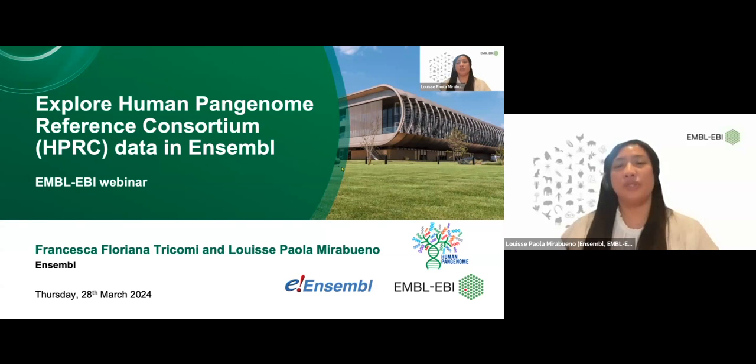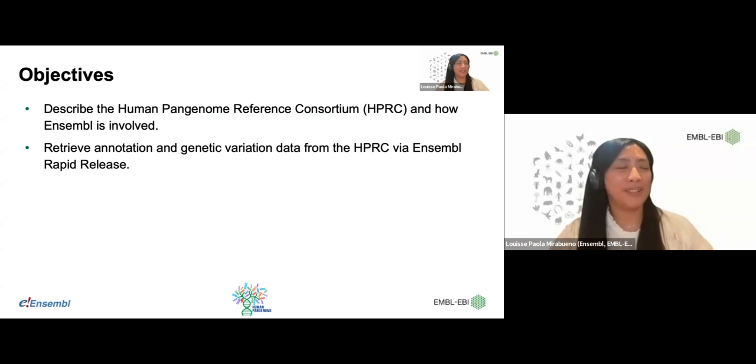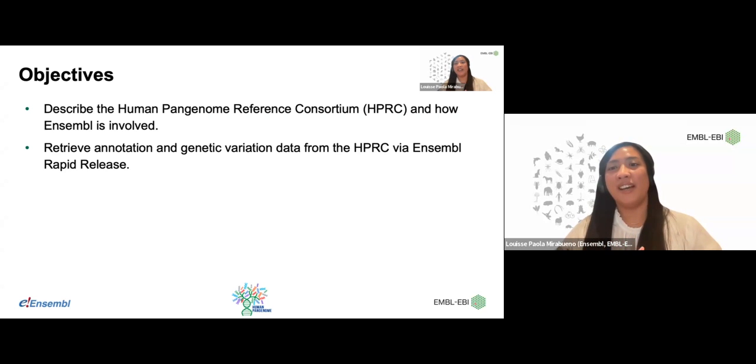So before I start, I want to show you what I'm trying to achieve for you at the end of the webinar. By the end of the webinar, I hope that you will be able to describe what the Human Pangenome Reference Consortium, or HPRC, is and how Ensembl is involved. And most importantly, how to actually retrieve annotated genomic data via the Ensembl Rapid Release website.